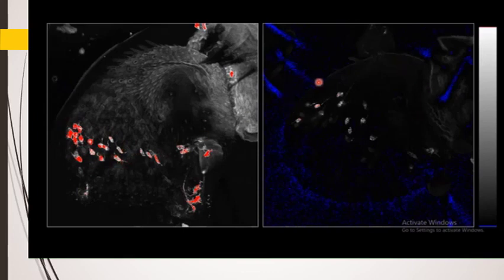In another image you can see here, it is pretty much offset, but the gain is not increased properly. That's why the features that we wanted to image are still dim. So gain and offset need to be properly adjusted such that we get a proper dynamic range of detection. And in a moment I will discuss what dynamic range is.